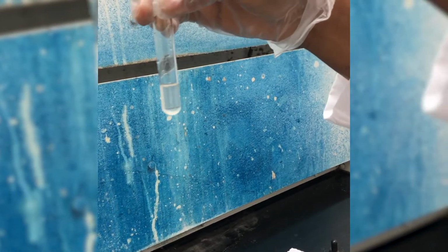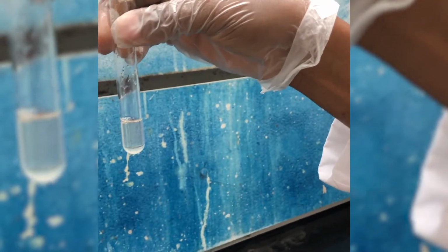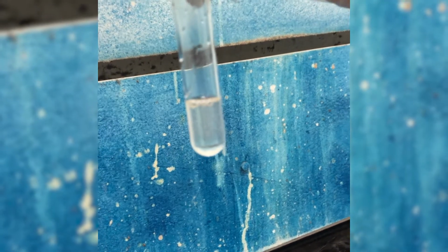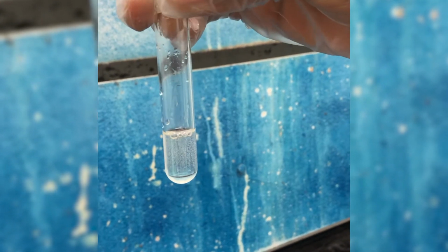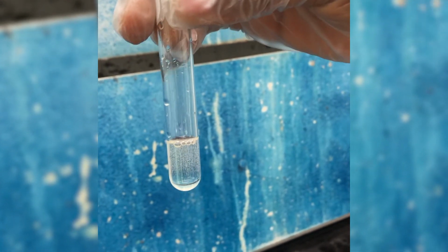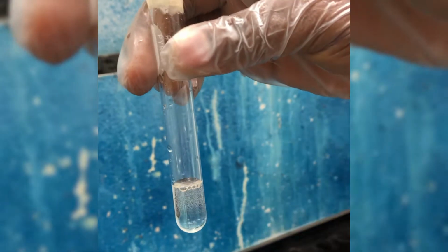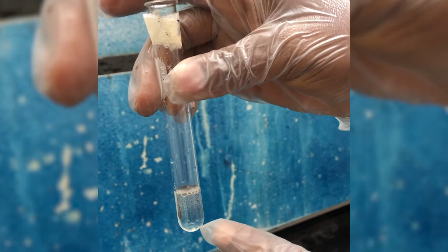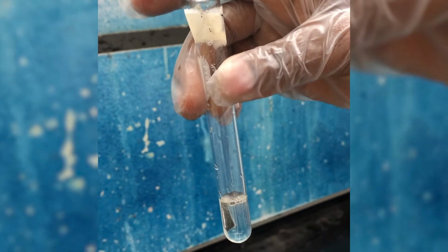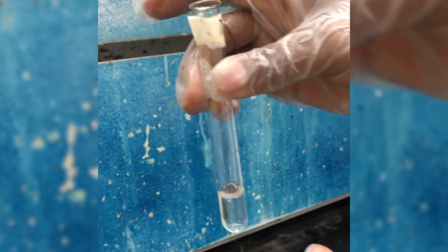You see the bubbles, the cloudiness. Yes, it's there. So this is the reaction of your secondary alcohol with your Lucas reagent, and then it goes away over time. You can see it dissipating at the bottom, and it's going away with time. So this is the reaction of the secondary alcohol.